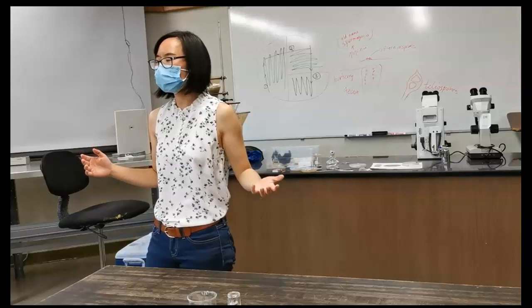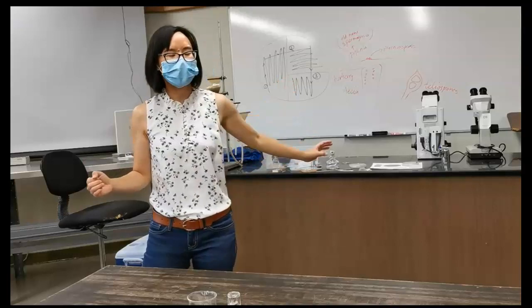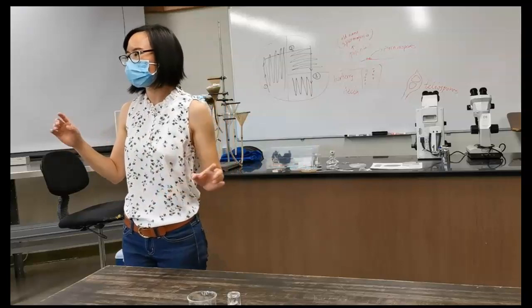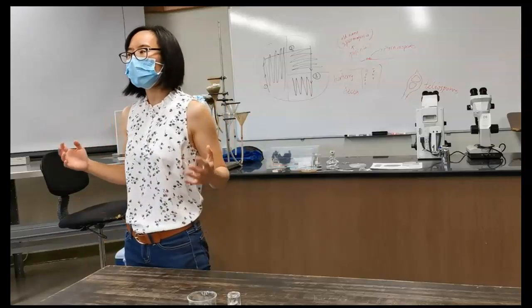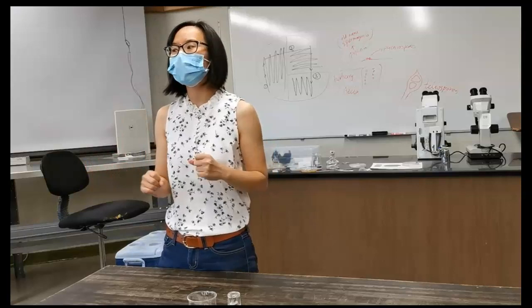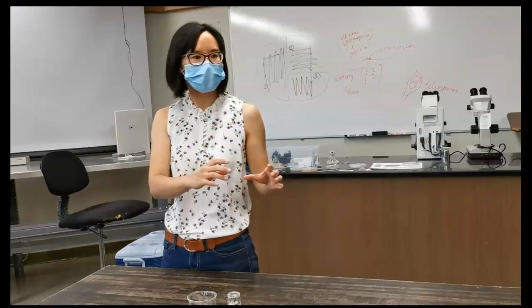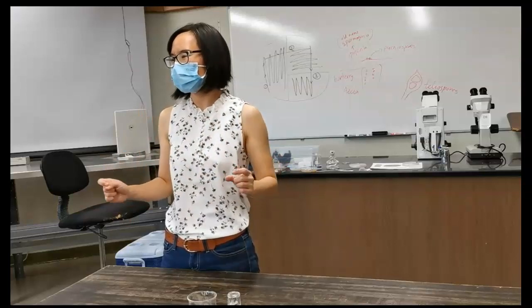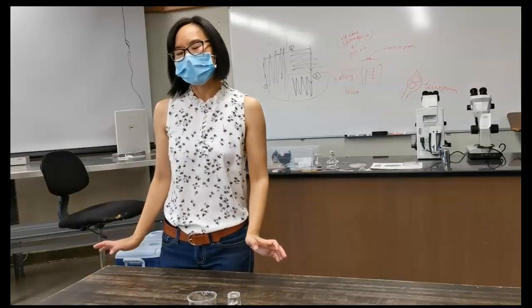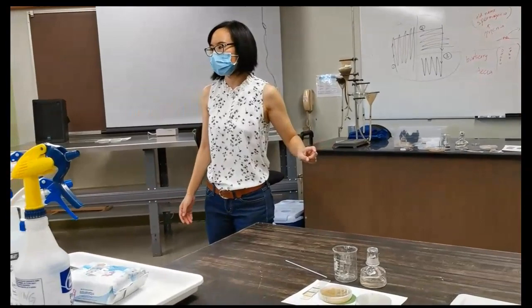So how can we tell if we get single colony or not? Well, after 2 days, the bacterial cells will grow. If you get single colony, you can see tiny dots of the single colonies. Apparently you're not going to come back after 2 days. So if you want me to take a picture of what you have done, you can have your name on the plate, label the plate really well, and then I'll take a picture and send you the picture, and you'll see whether you did 3-way streak successfully. So that's 3-way streak. And then the last thing is the nematode.